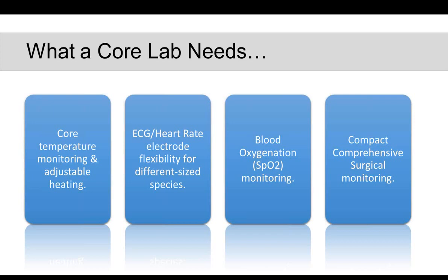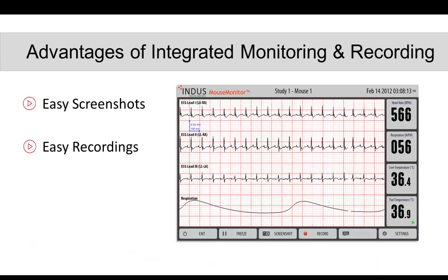And the last thing is that it provides a means of compact, comprehensive surgical monitoring, because it's essentially the size of a small board, and then all of your data is being output onto a pad. And those are the only two things that you have to have for this setup.